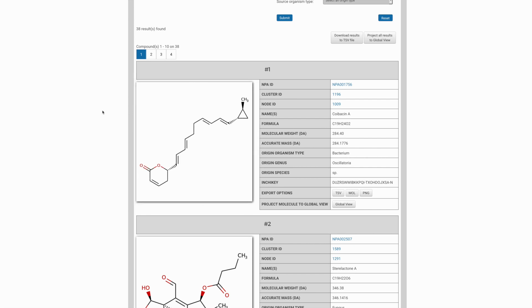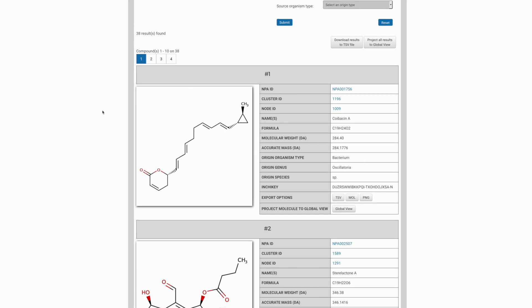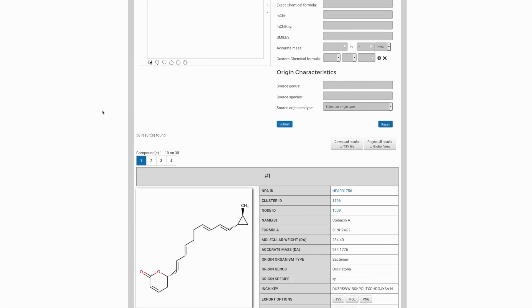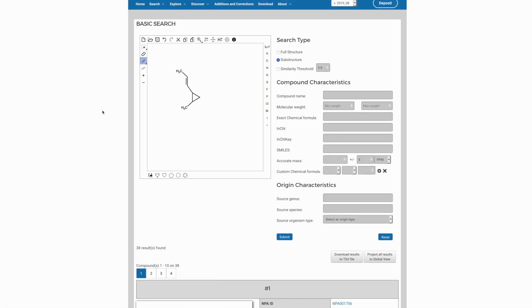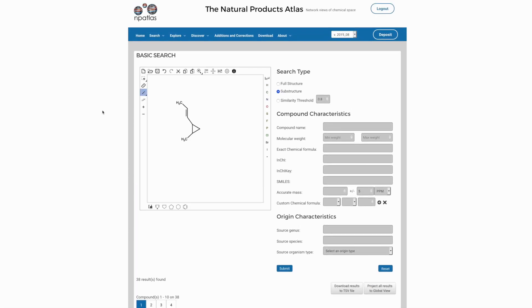However, 38 is still quite a few candidates to compare between, so we can further refine this using a variety of characteristics from this compound characteristics section.